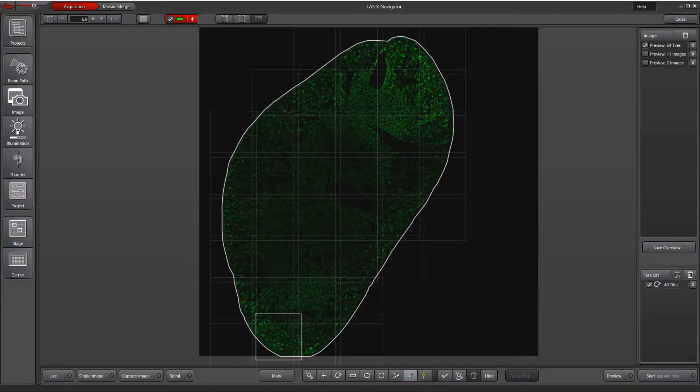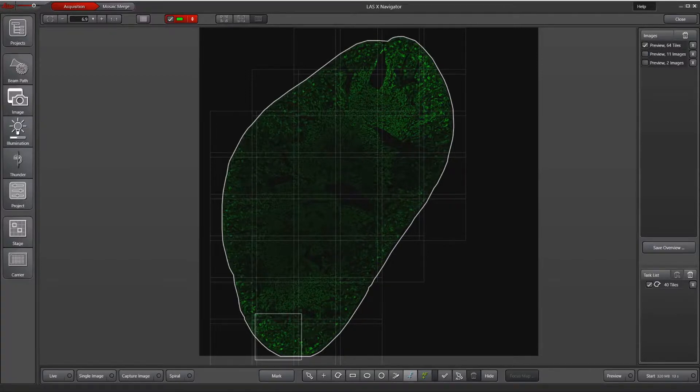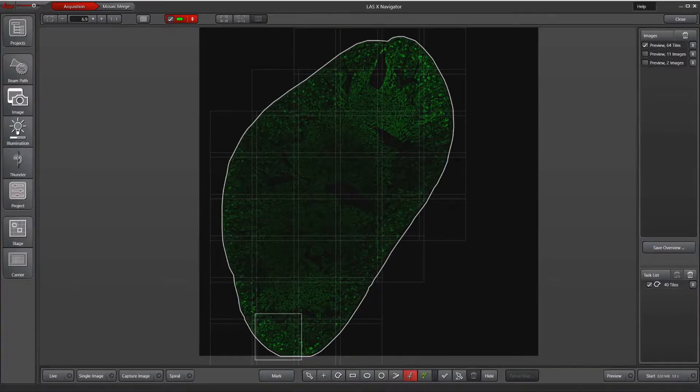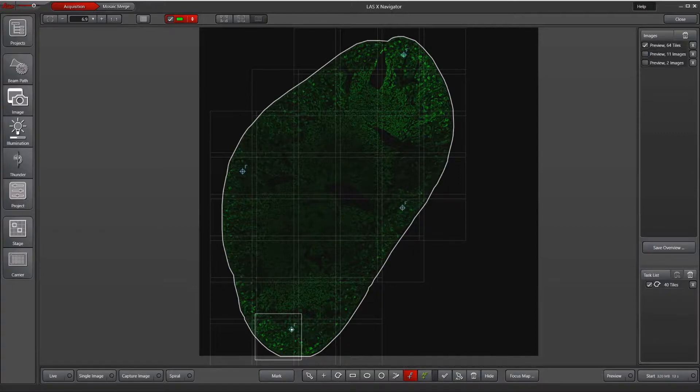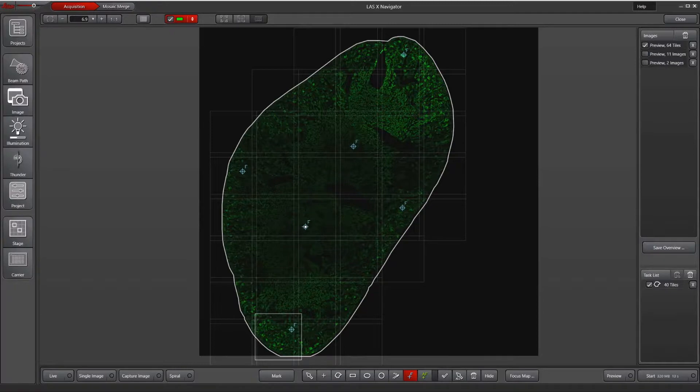The placement and number of focus map points really varies quite a lot depending on your tissue and how variable it is. Most of the time, the rule of thumb is you'll want to do at least four focus map points on the corners of your section. From this one, I'll do kind of a west, north, east, south configuration. And then depending on your tissue, you might want to add additional points like perhaps the middle of this kidney, which might be a little bit different in focus compared to the cortex.